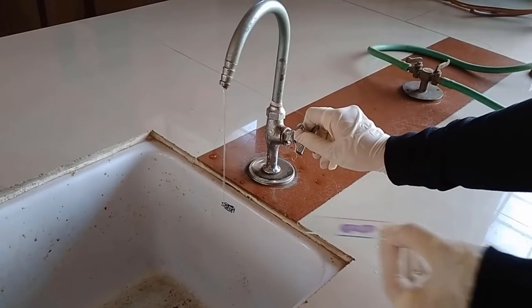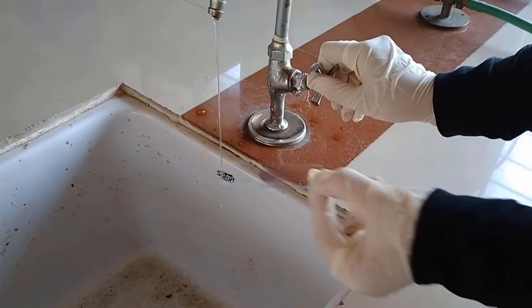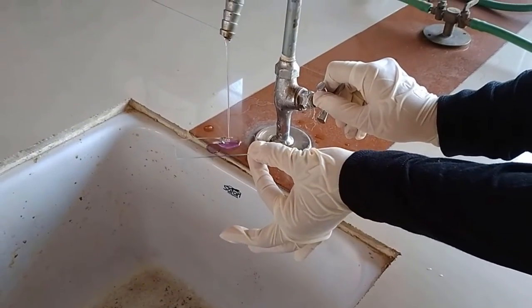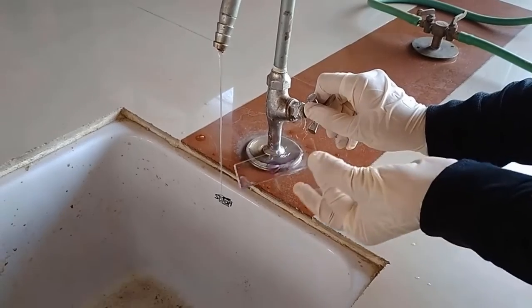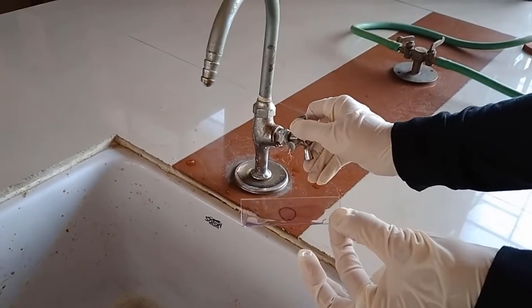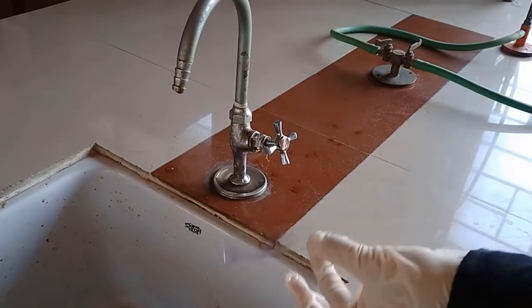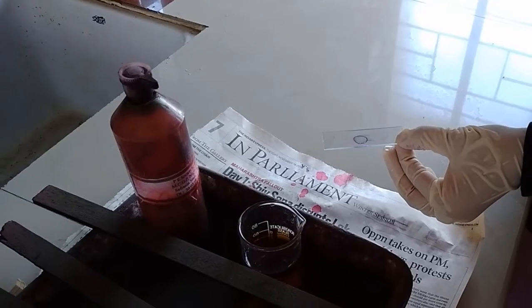So after 1 minute you can see that the stain has completely dried off. We will wash and remove the excess stain. And allow the slide to air dry. Now you can see that the slide has completely dried off.